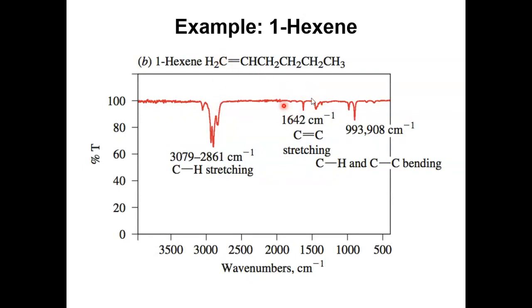The C=C double bond generally gives you absorption around 1650 reciprocal centimeters. But because the polarity is generally low, the peak here is actually weak. But this C=C double bond is not completely nonpolar, because at one end you have alkyl groups attached to it, and at the other end there's no alkyl group.